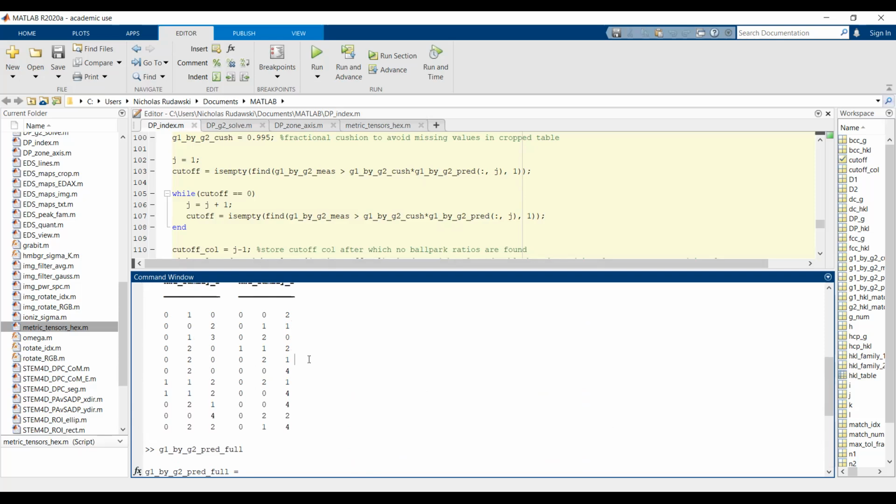Some of these are mathematically multiples of the other, like this one is just a multiple of this guy, so we can get rid of that. What we're left with is a few different answers that could work. I know that the answer is this one specifically, though.